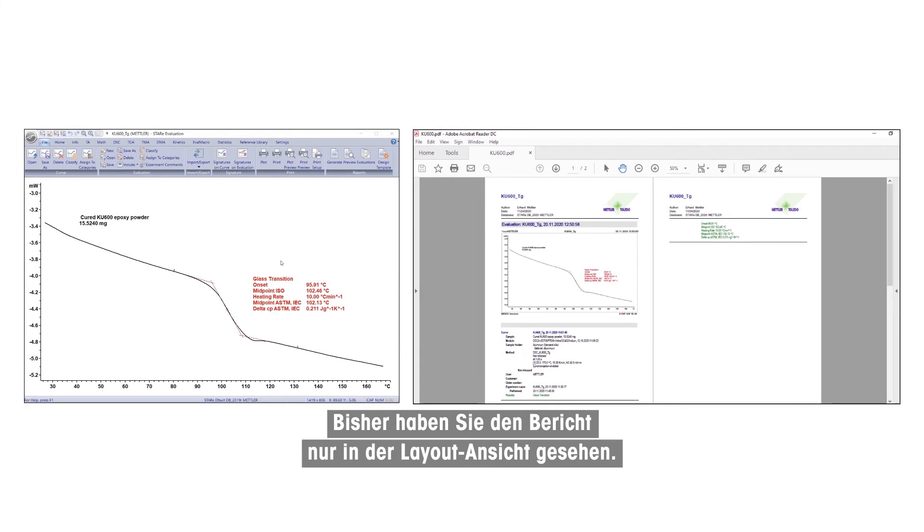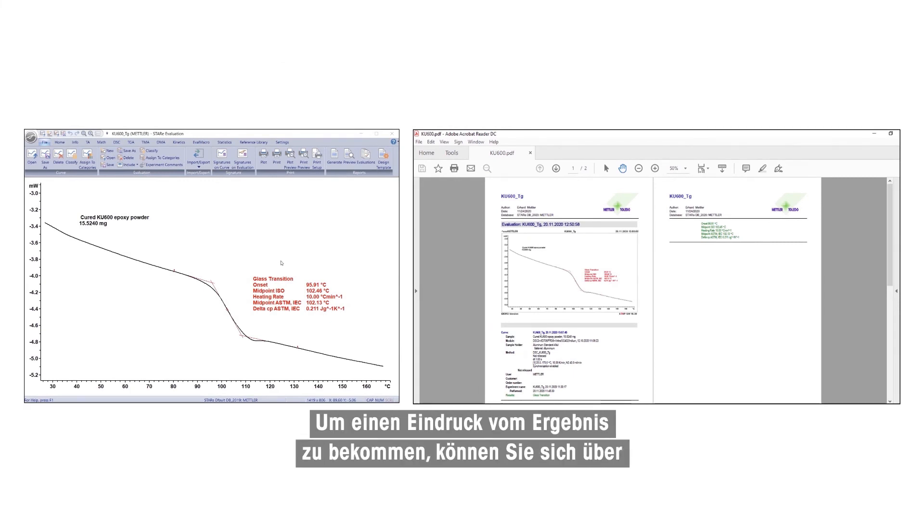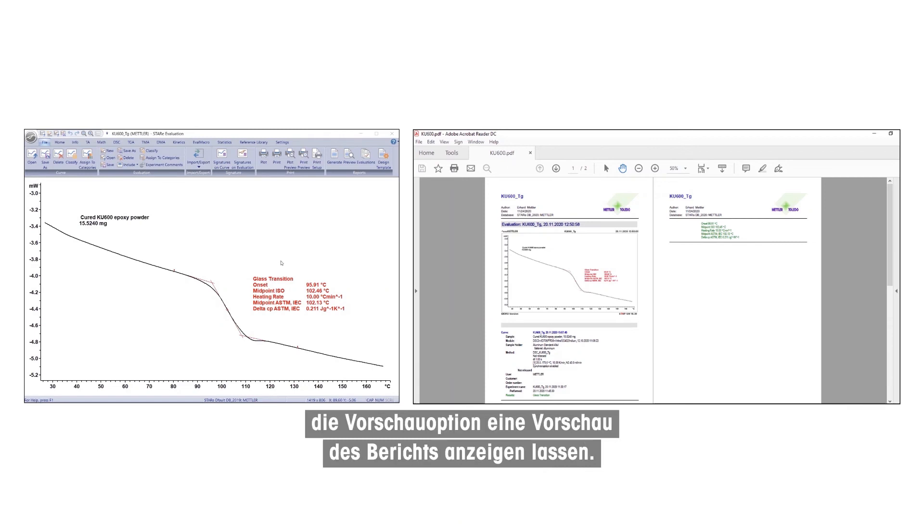Until now, you have only seen the report in Layout view. To get an impression of the result, you can display a preview of the report by using the Preview option.